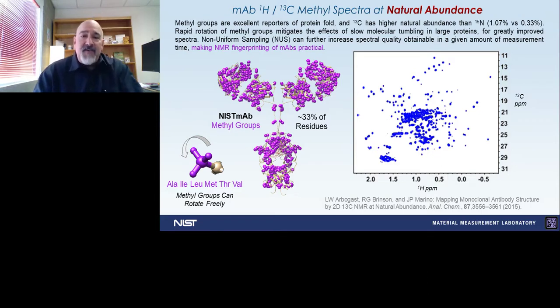So what I'd like to do is show you what kind of changes we can induce in the protein as a test case and how we can detect these changes by NMR spectroscopy.